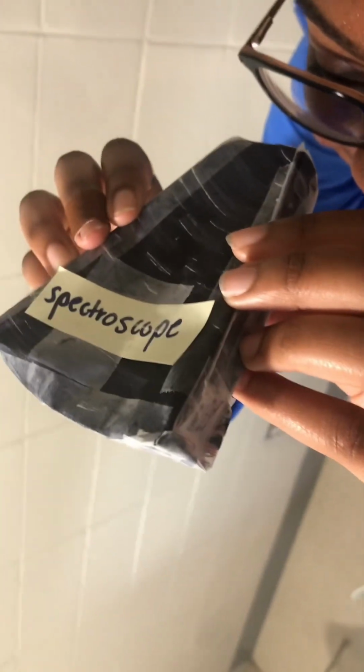First, to ensure your spectroscope is properly adjusted, set up a white light source. Dim the lights of the room so that the light patterns may be seen. The room, however, should be lighted enough for the energy scale to be seen. Hold the spectroscope with the eyepiece towards you and the small square opening at the other end close to the light source. If you look into the eyepiece, you should see a small vertical rectangular slit.